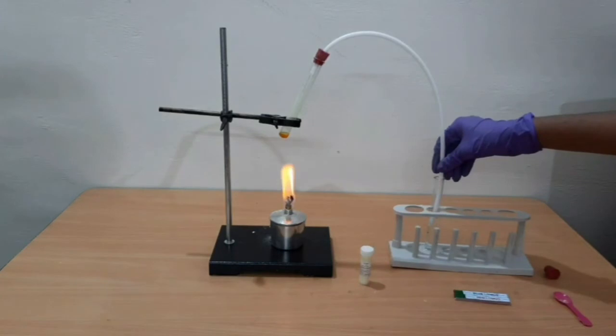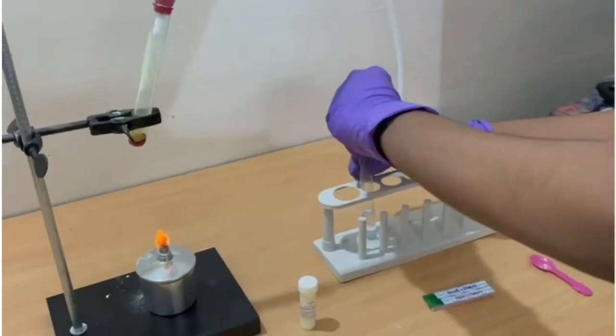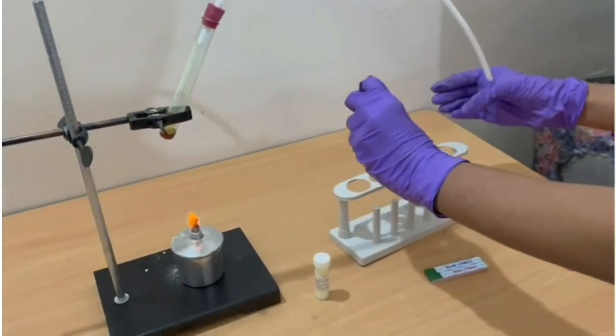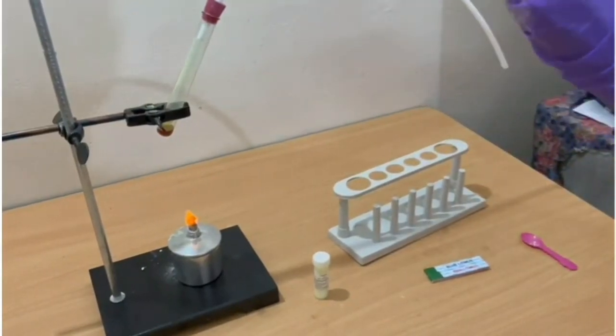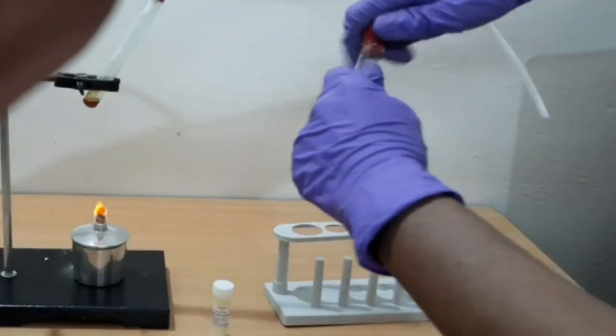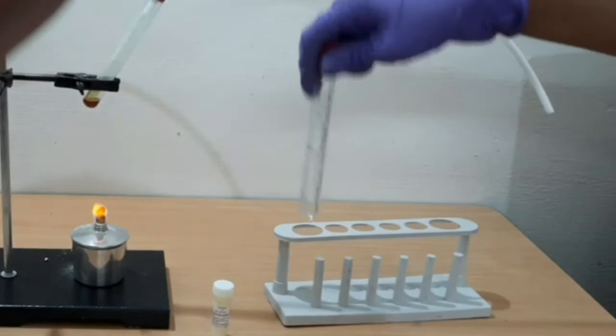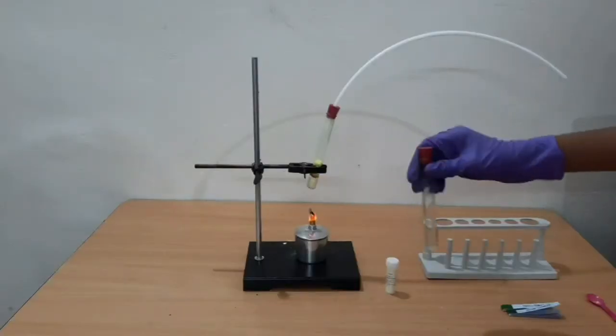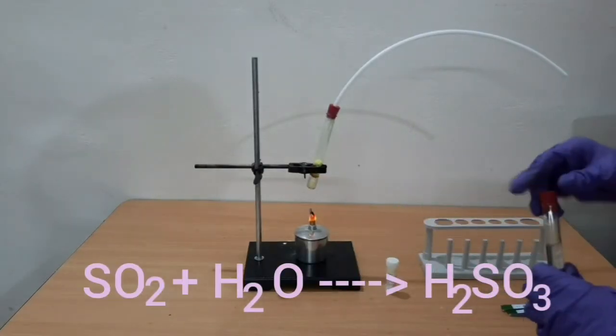Collect the gas liberated on heating sulfur powder in the other test tube containing water. Now shake the test tube to mix sulfur dioxide with water. The sulfur dioxide dissolves in water to form sulfurous acid.